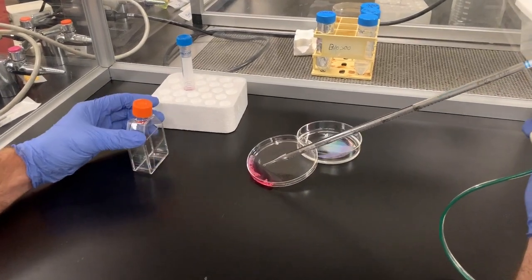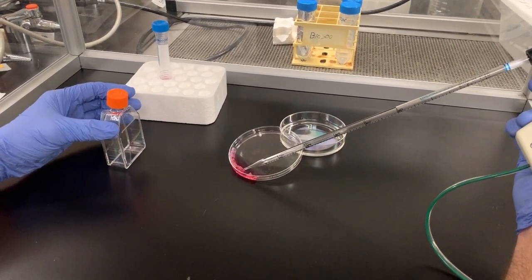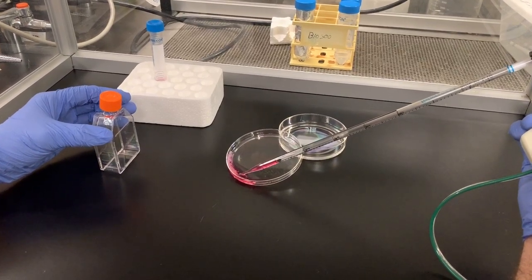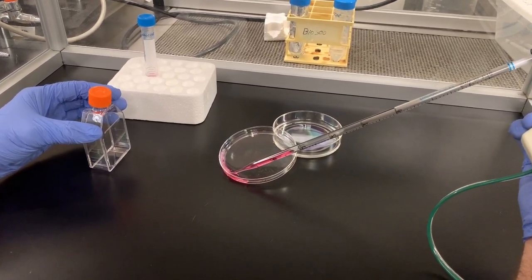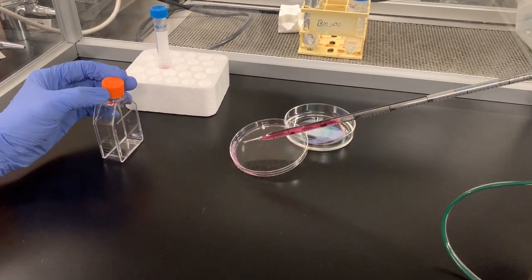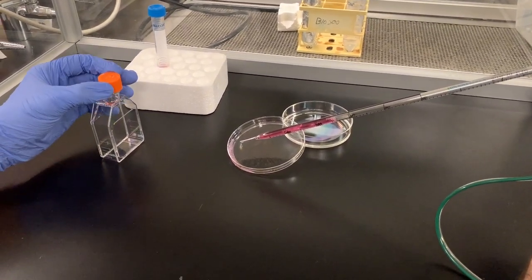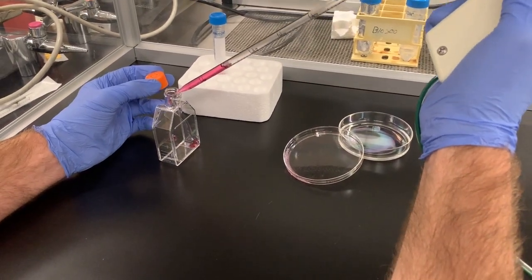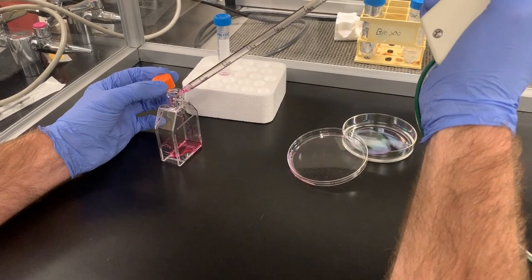After the EBs are rinsed from the surface of the dish, transfer the media and the embryoid bodies from the petri dish into a sterile culture flask. You then store the flask in a cell culture incubator.